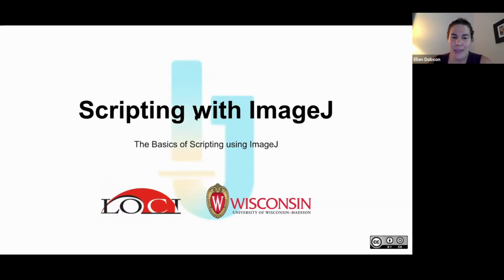Again, that depends on how well you can delineate that portion. It depends on how good the signal to noise of the region is, or whether you are better off using the machine learning tool we talked about last week to train the computer to select that region. So that's really data dependent.